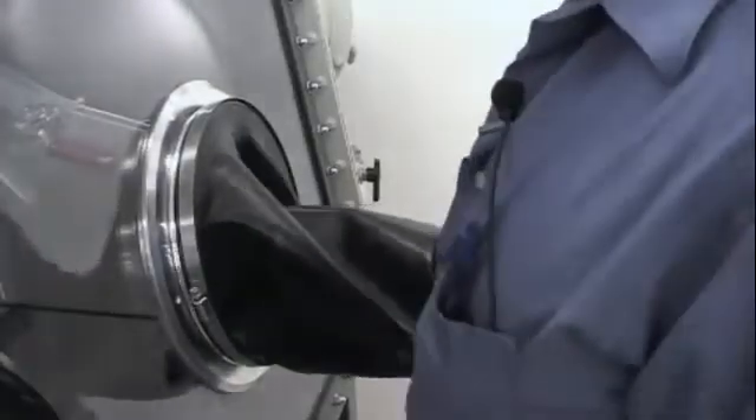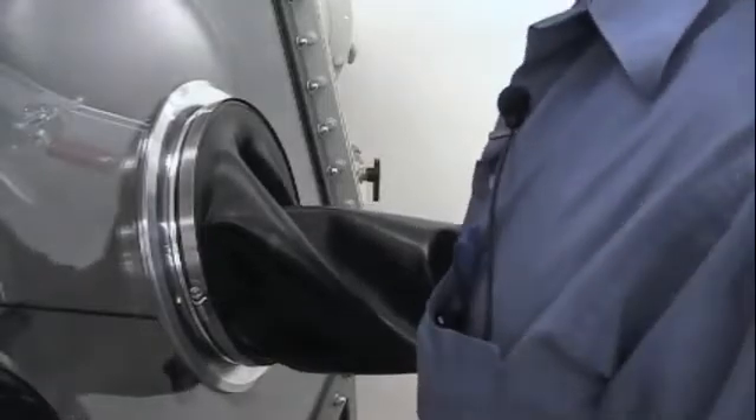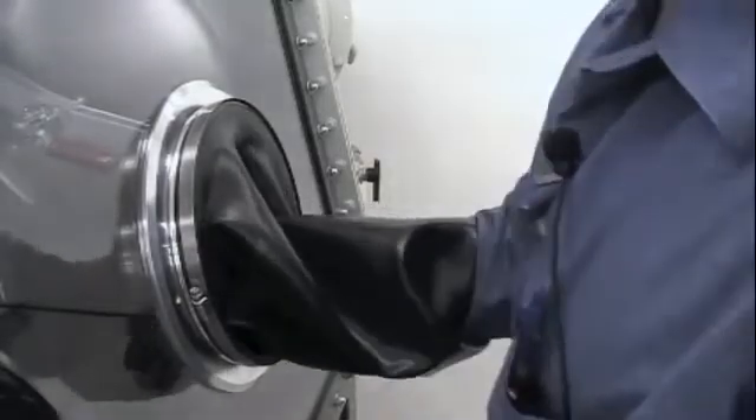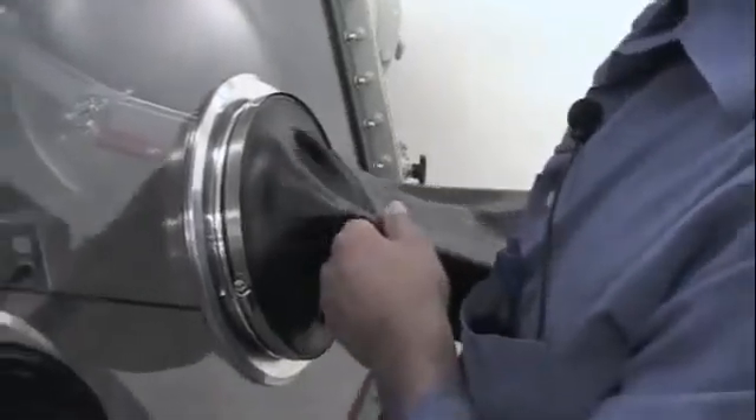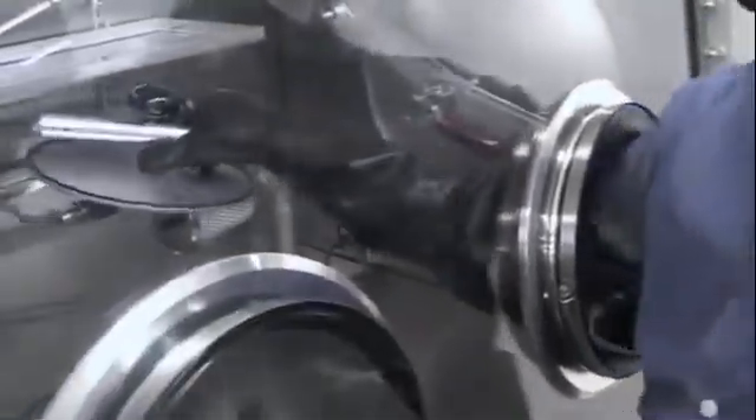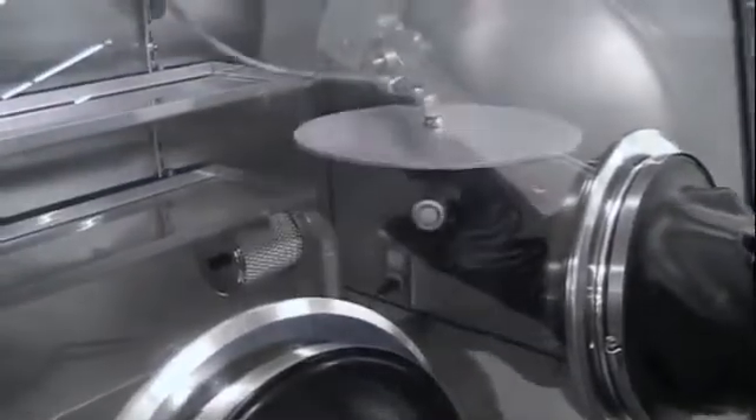Hello, my name is Guillermo and I'm with Vacuum Atmospheres Service Department. In this video today I'm going to demonstrate how to replace a rubber glove utilizing the evacuatable glove port cover.